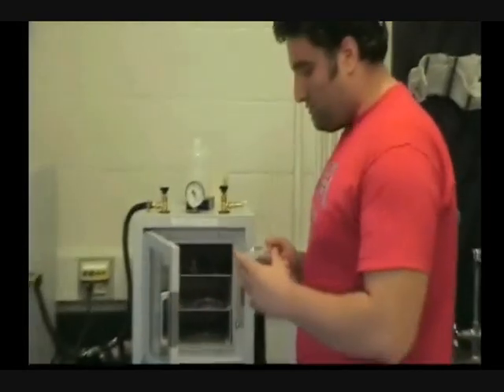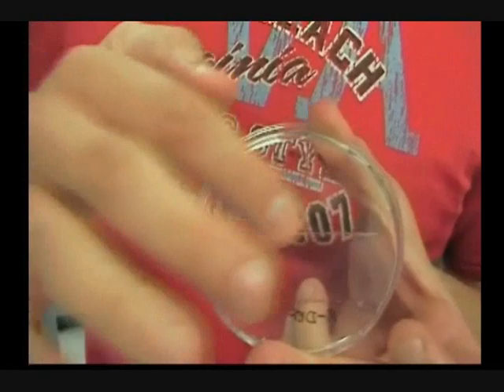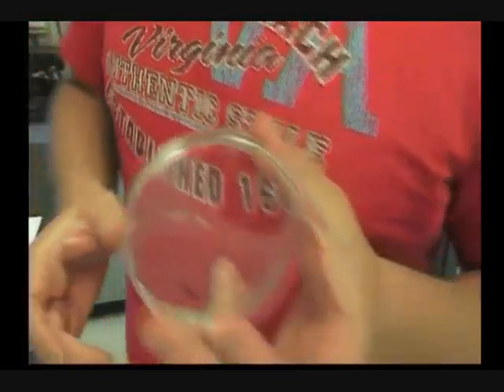Bubbles are removed. You see there is no bubble. There is one bubble, but it is between the glass slide and the petri dish, so it is not important for us. But the overall bubbles are gone.